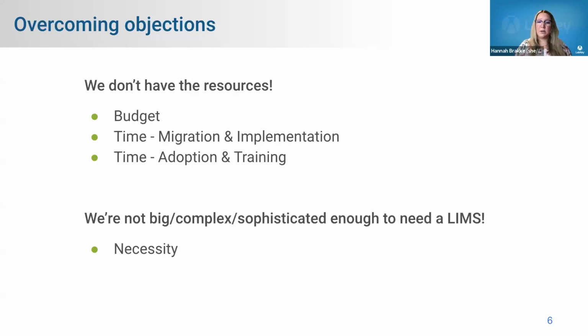So, as I mentioned, with a small user count, you can start to consider a pre-LIMS product, something like a sample or inventory management system that will help you with some of these pain points, but maybe not all of them, and allow you to grow into a LIMS. And my advice here is to find a company that allows you to grow, rather than picking one and then having to go to another LIMS, and now you have multiple competing systems and you're struggling with that.